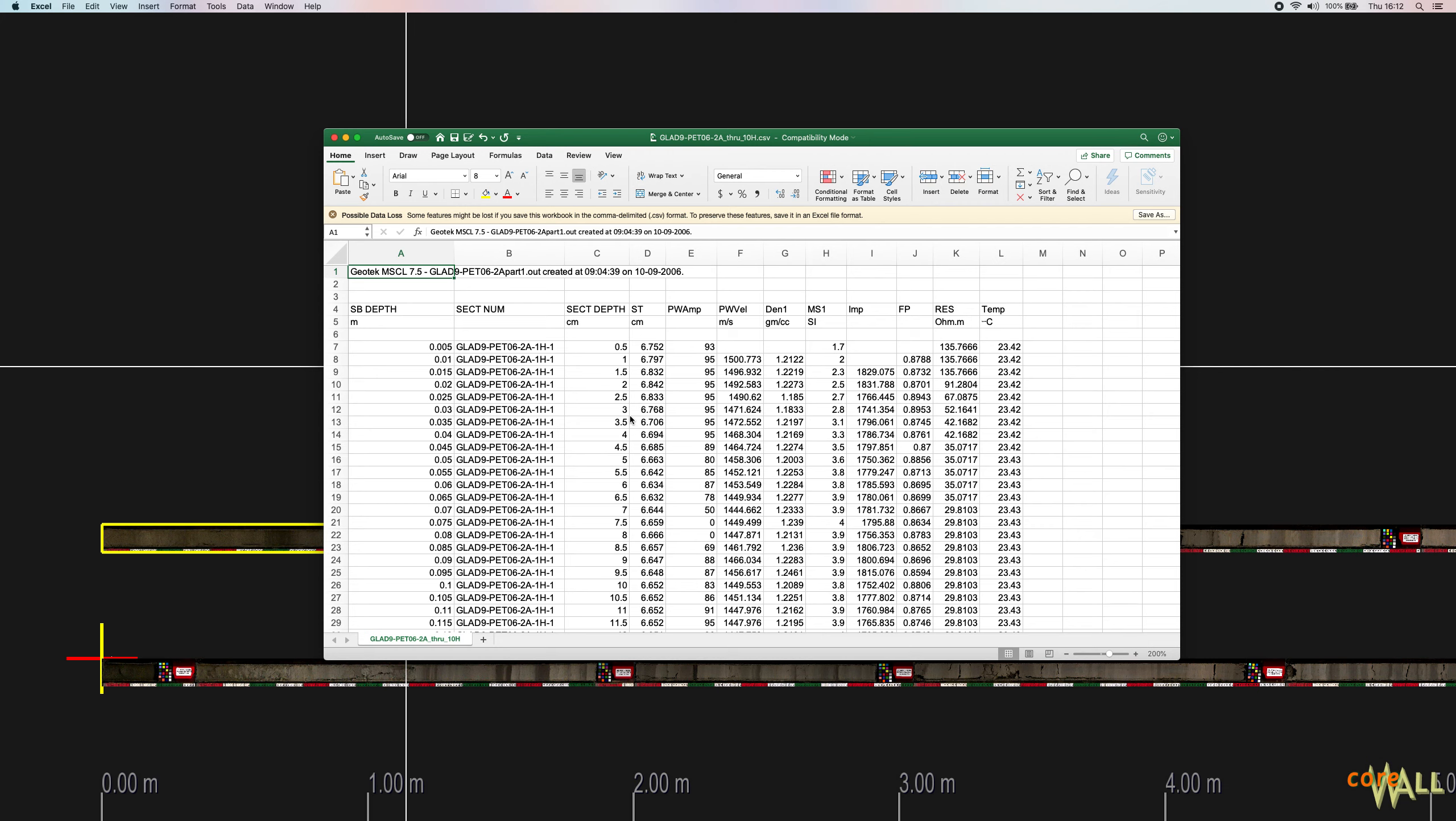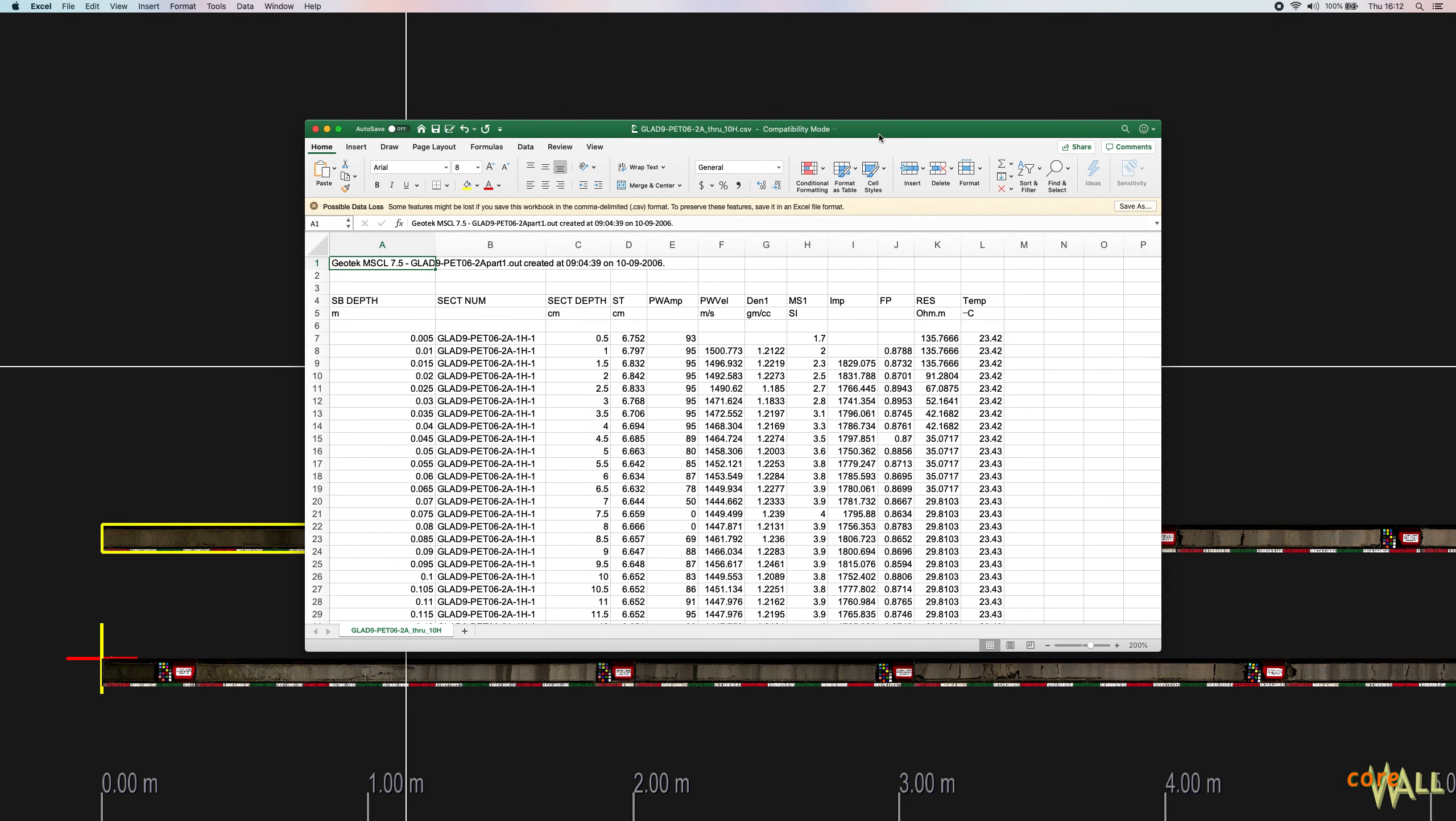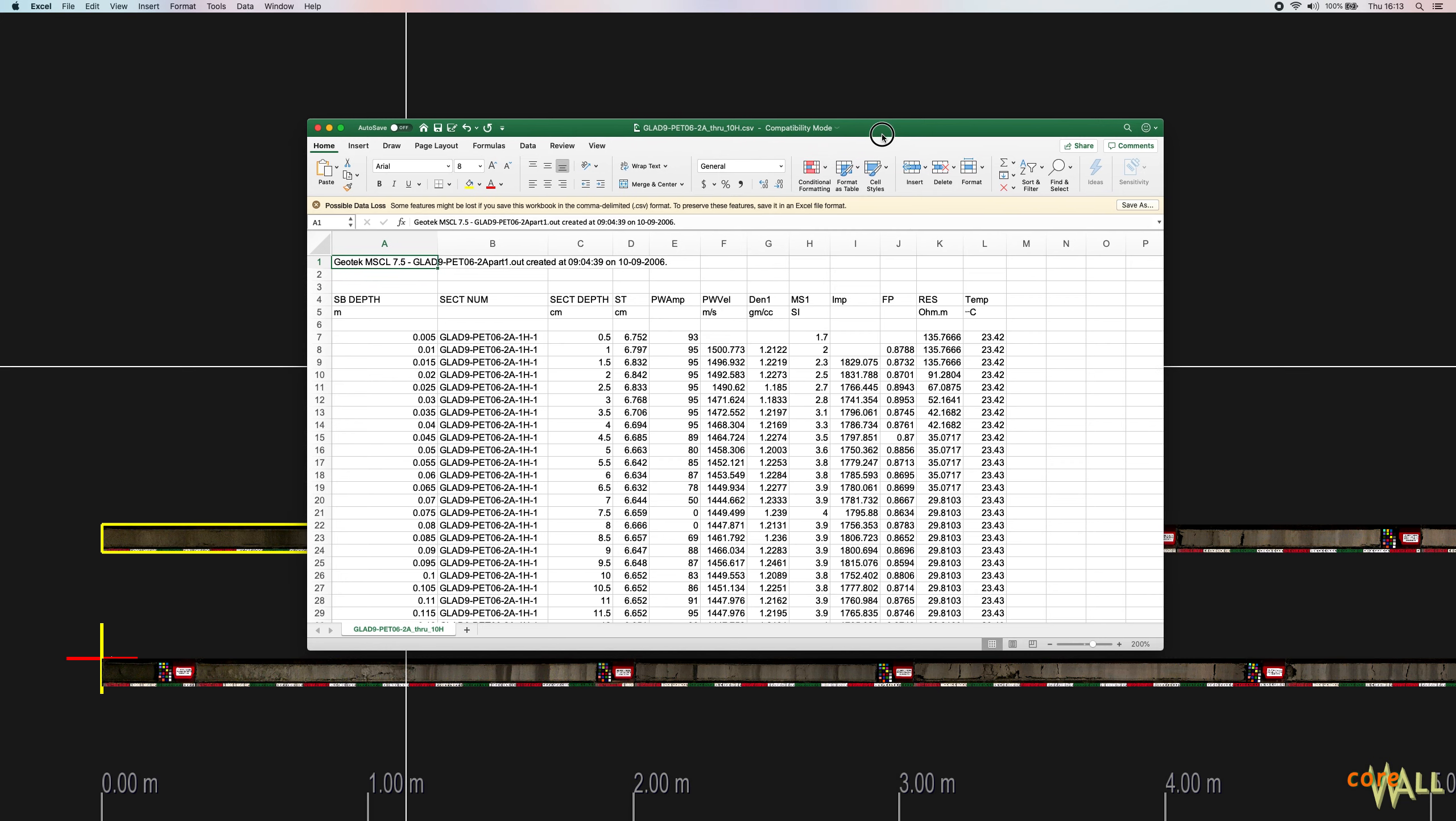To start, you'll need a tabular data file with values separated by commas, tabs, spaces, or semicolons. A comma separated values file, or CSV, is the most commonly used tabular data format and will be used in this demo.